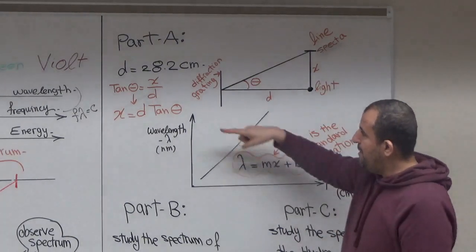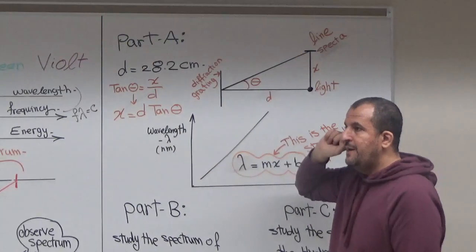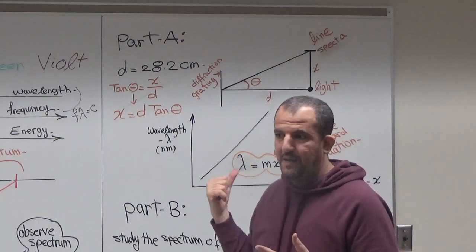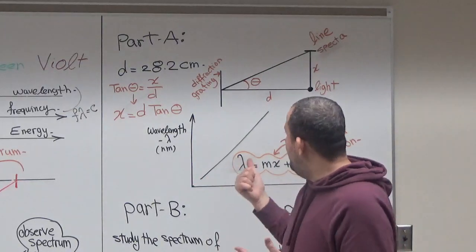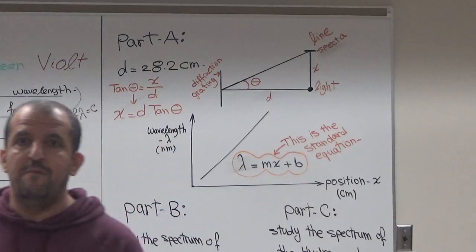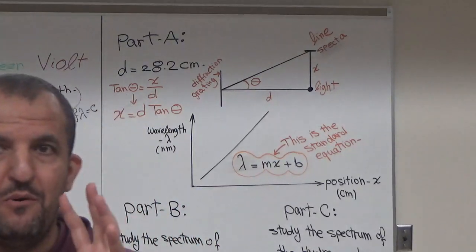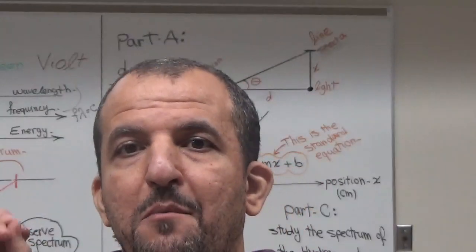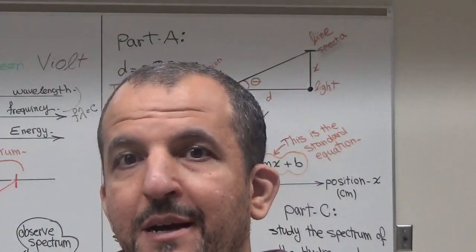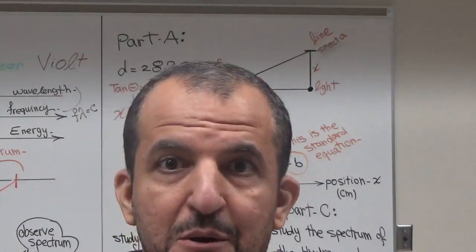Now guys, when you plot wavelength, you might ask me, how can you find the wavelength? You can find the wavelength, guys, for Mercury from the worksheet. The worksheet can provide you with the brightest line spectra in the Mercury spectrum.